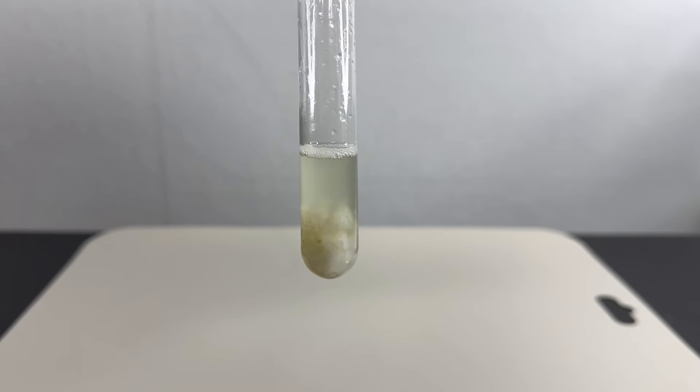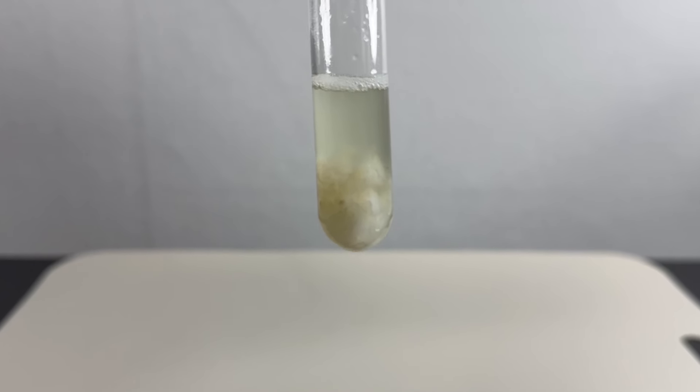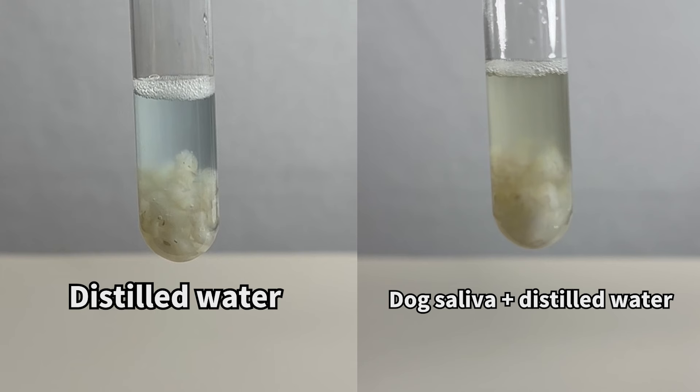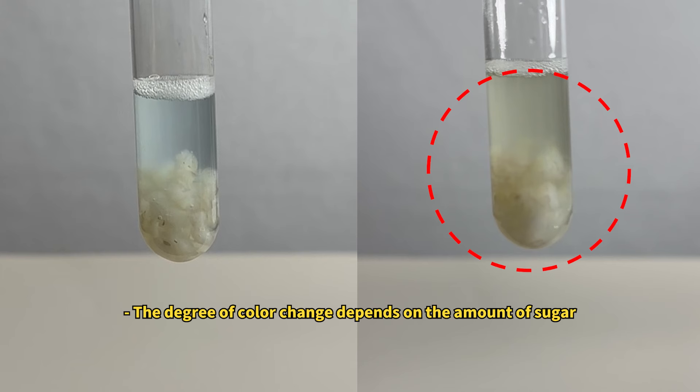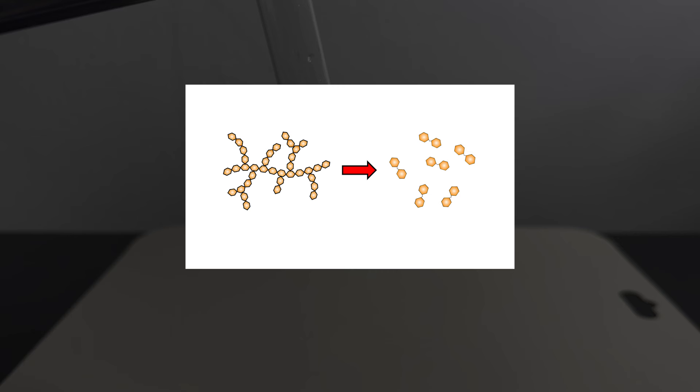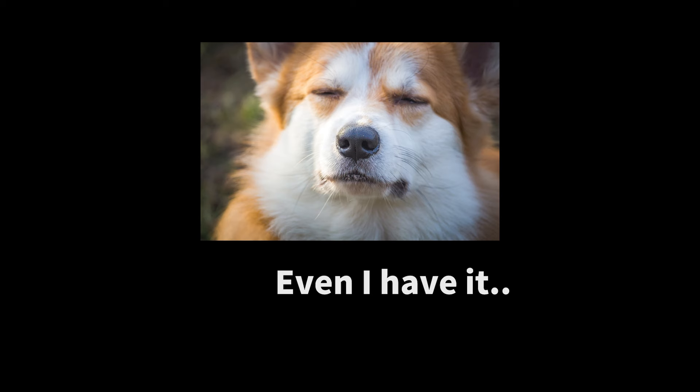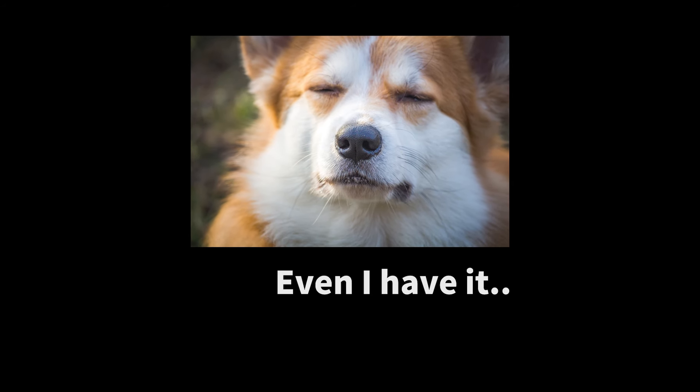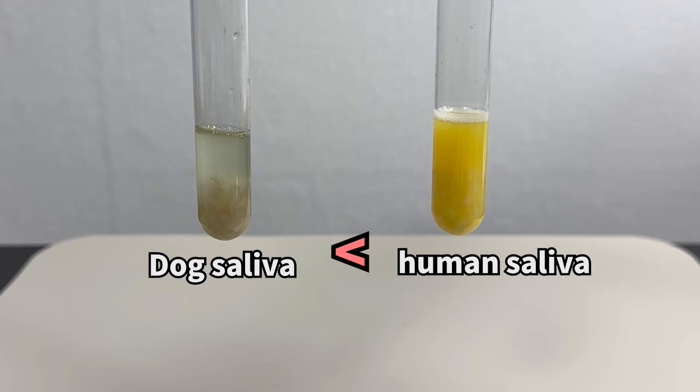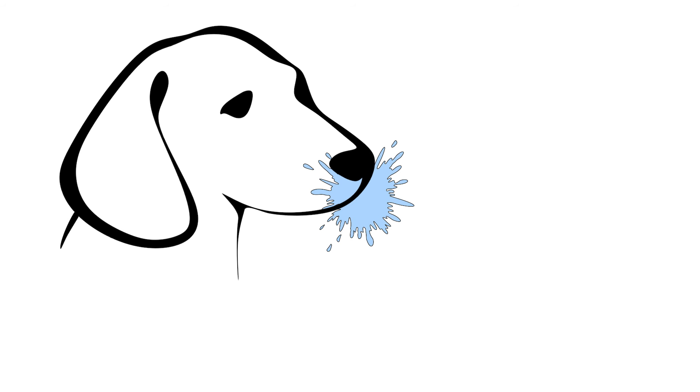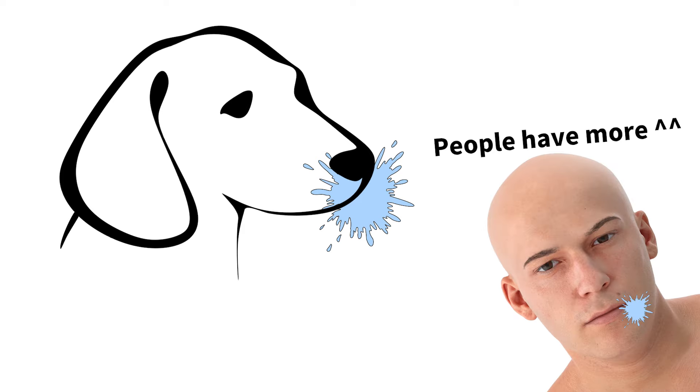Hmm, there seems to be no significant change. But upon closer inspection, there's a slight yellowish tint, more than when just the rice grains were present. This suggests that some starch was broken down, indicating the presence of amylase in dog saliva. However, the reaction isn't as strong as in humans, because the concentration and activity of amylase in dog saliva are much lower.